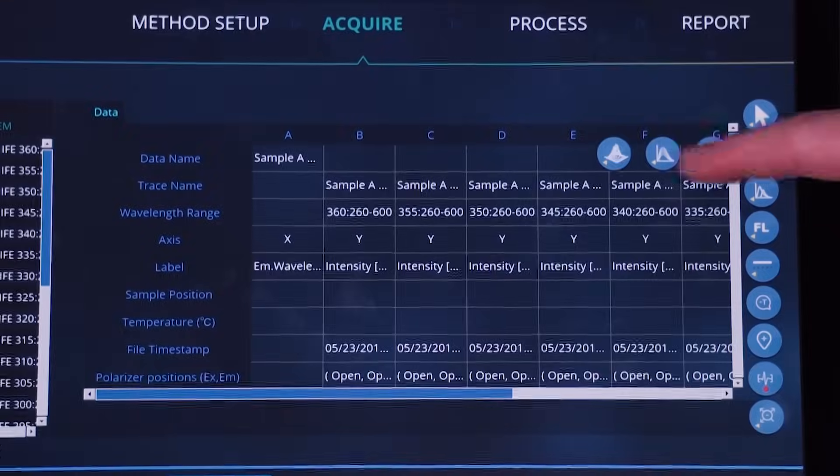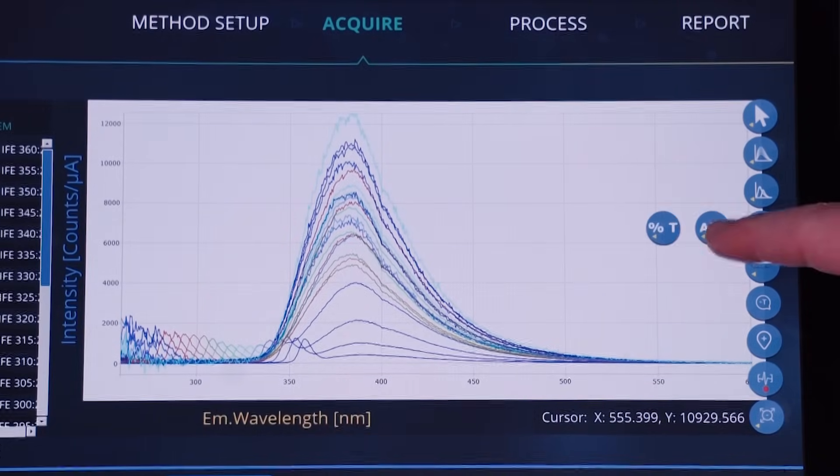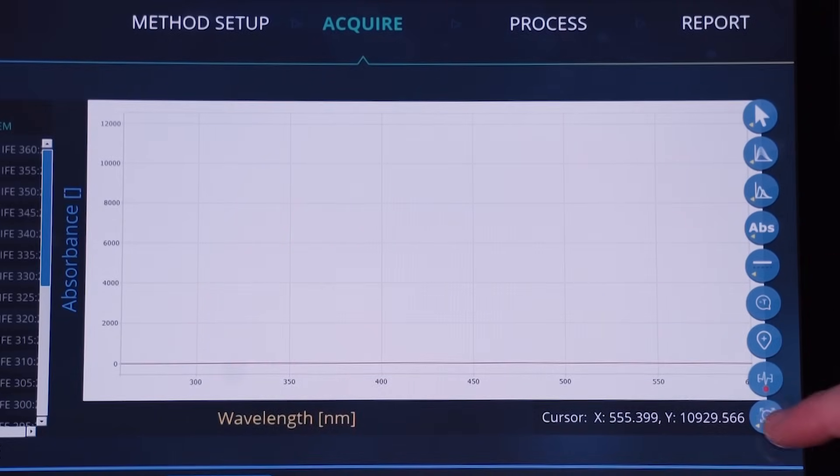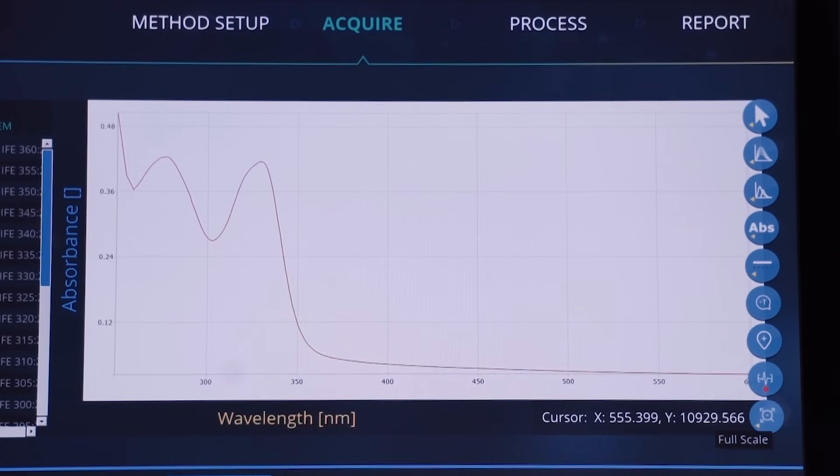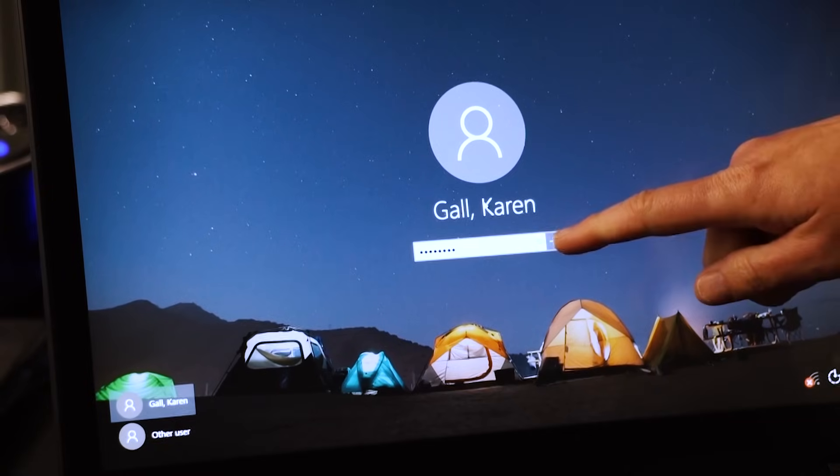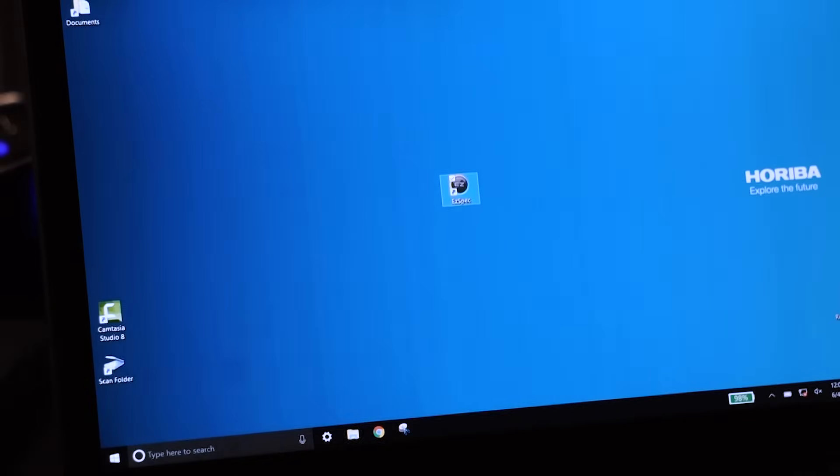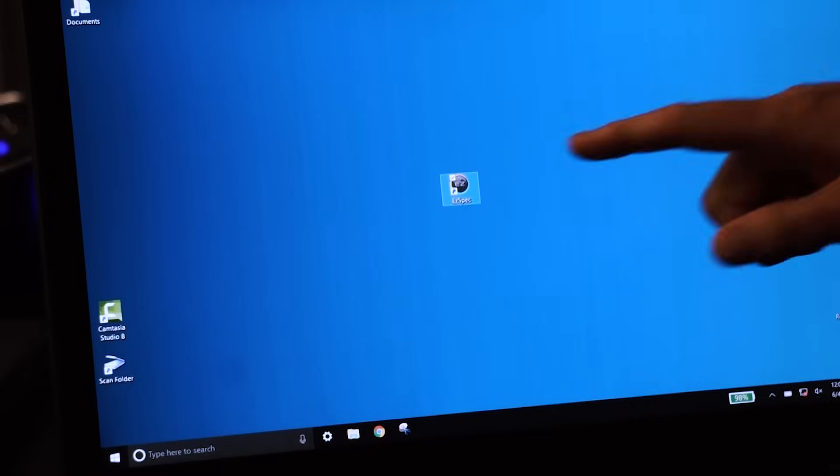The simple graphic interface allows you to easily initiate various experimental methods. EasySpec remembers as many unique profiles as the computer allows.